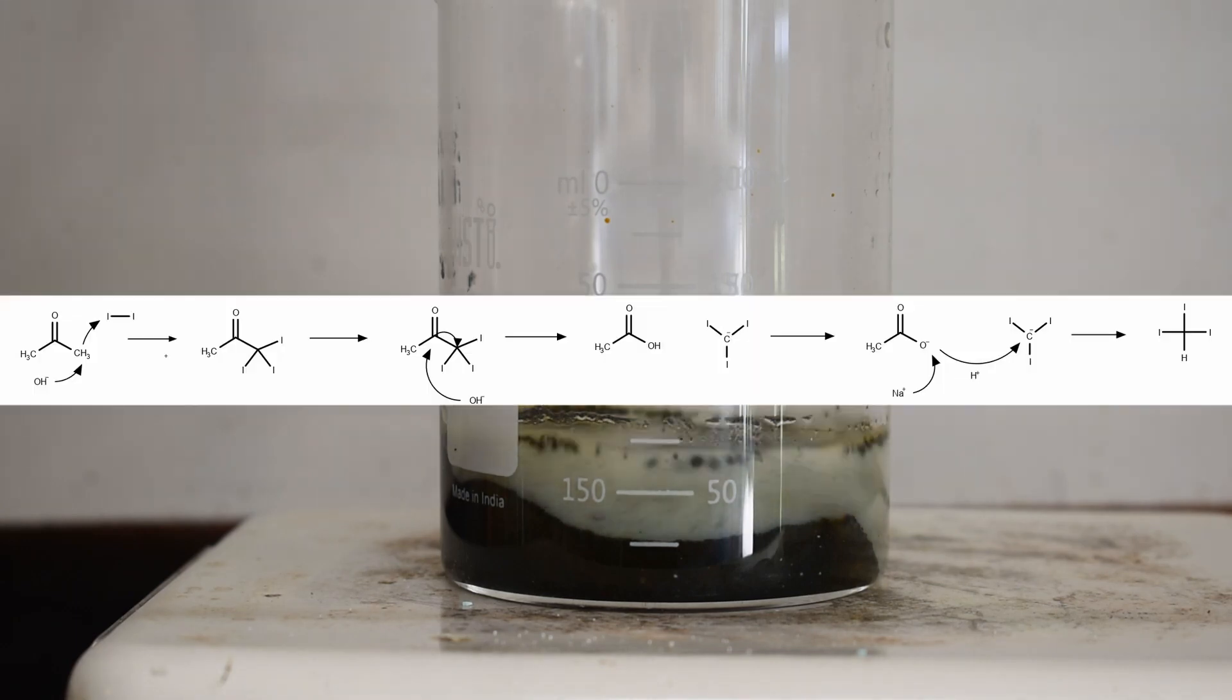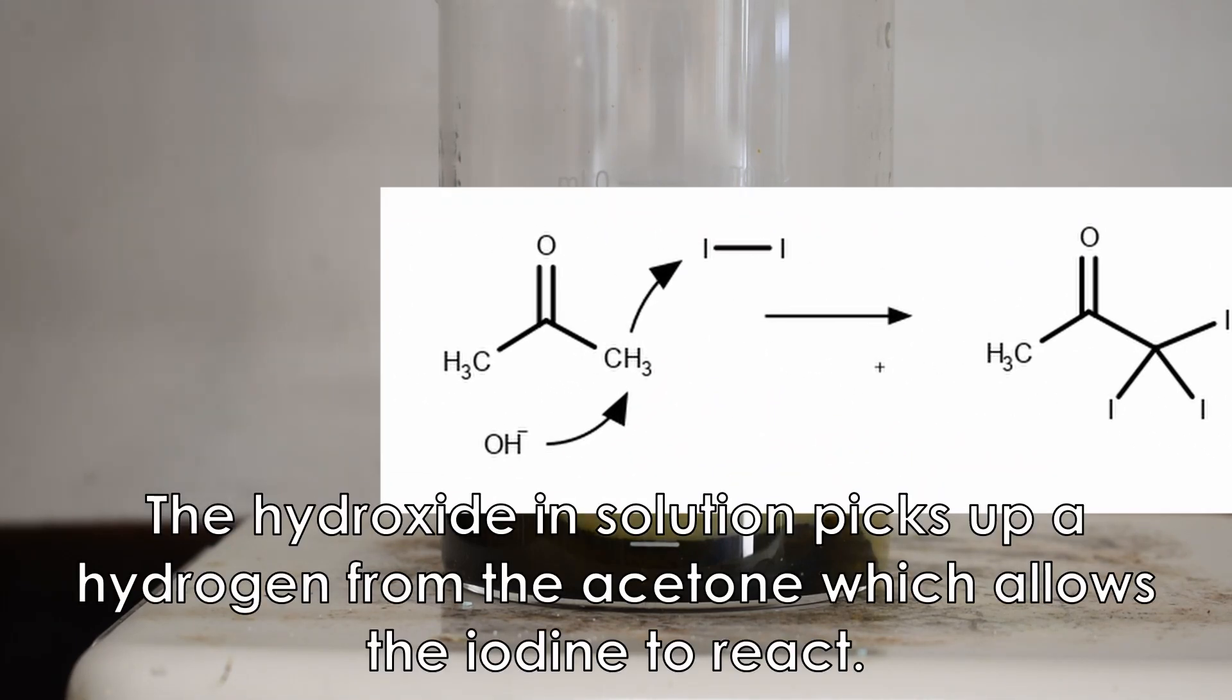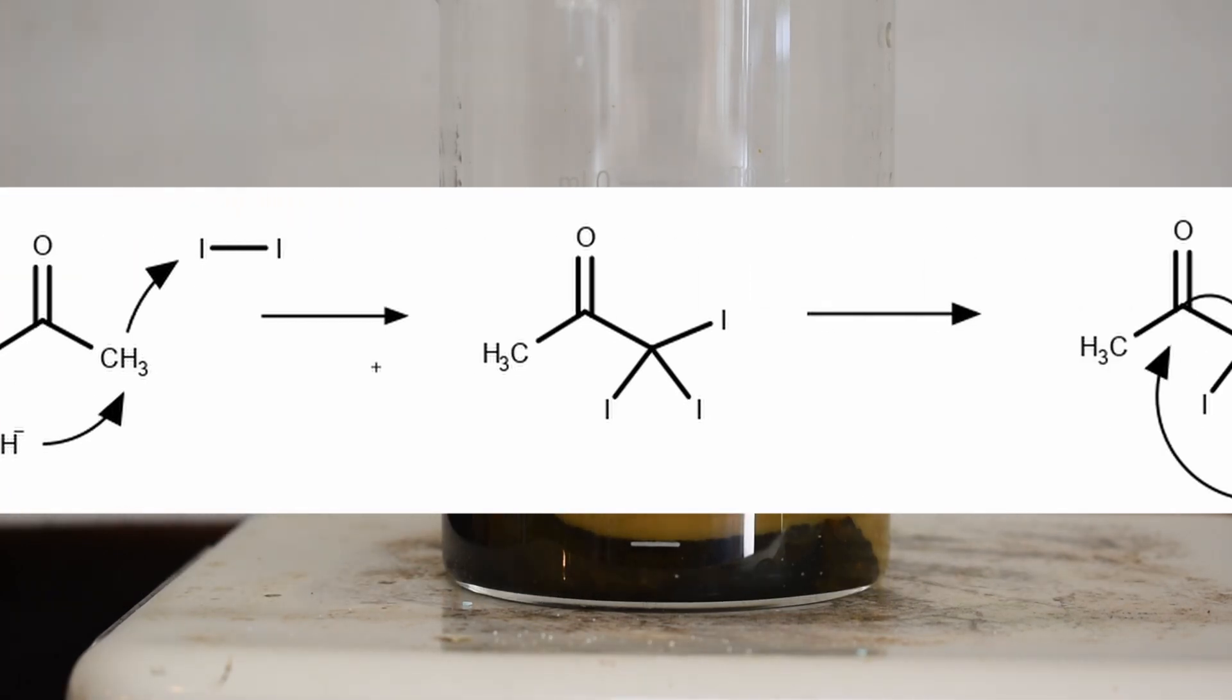So what's happening here is the haloform reaction. Basically the elemental iodine is reacting with the acetone to form a tri-iodo acetone intermediate.